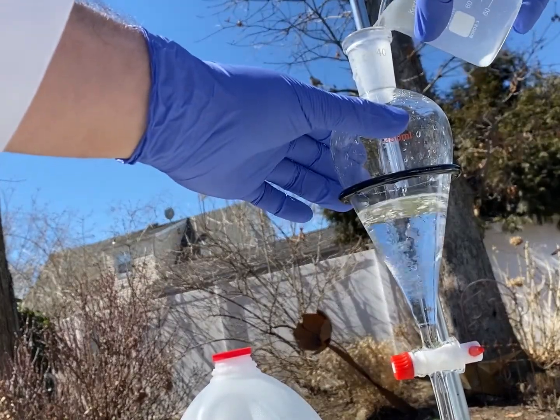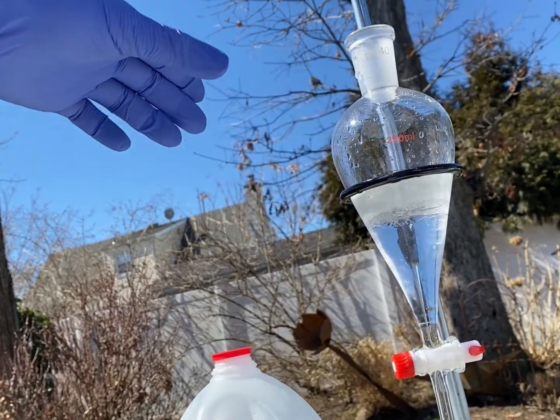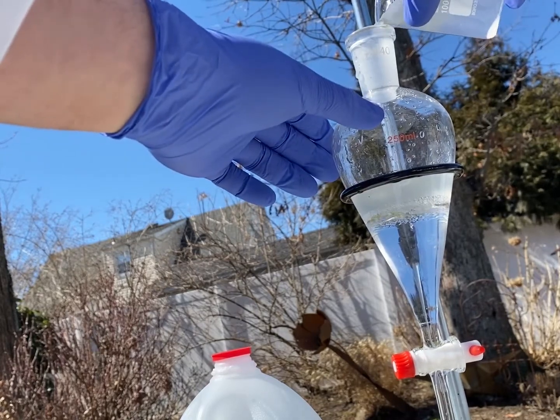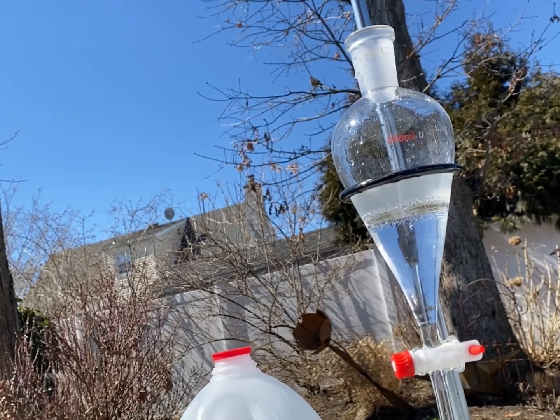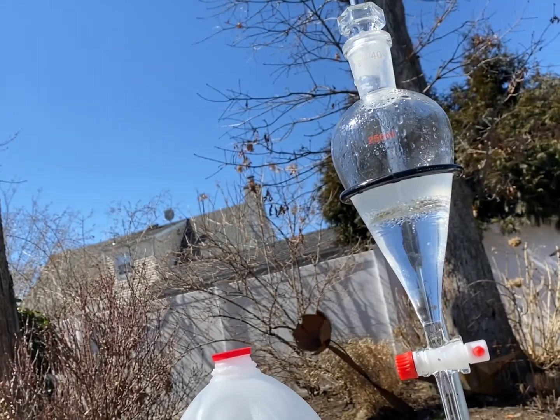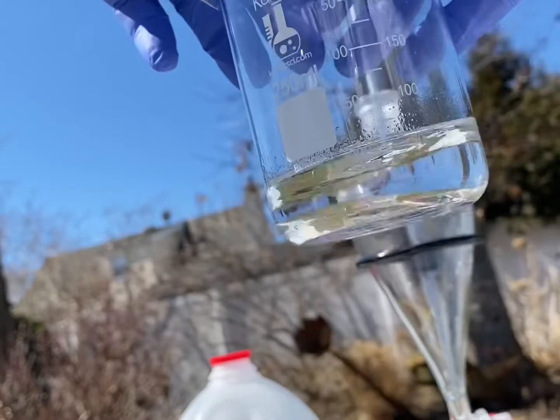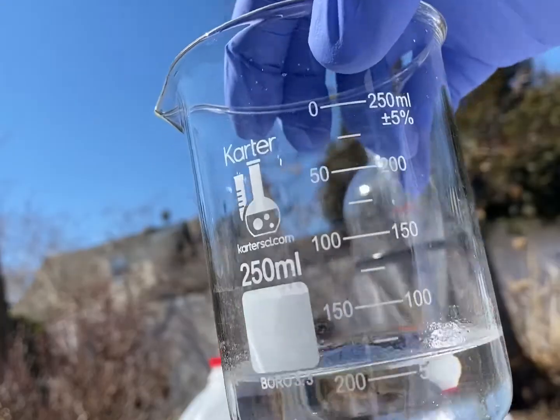So here I am adding that. I'm gonna add about 50 mLs. So 10 more. Sorry about that, there's some construction going on next door. So now that I've added that, I'm going to shake and vent it, and I'll be right back. And as you see, I'm letting the water separate back out, and then I'm going to collect the bottom layer again, and then we will go and distill it. Okay, so here we have it, our crude product. We're gonna distill it, and we'll see how much we get.